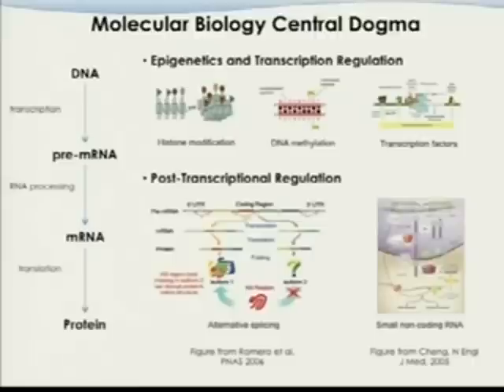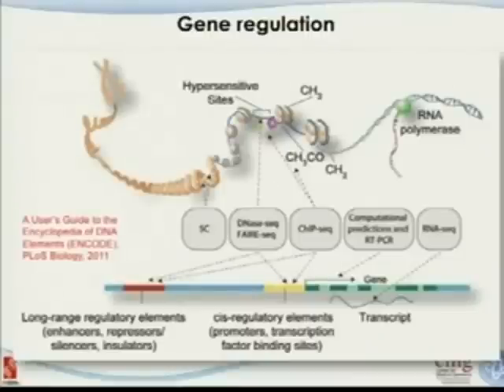If you modify the protocol a little bit, ChIP-seq or some other immunoprecipitation-based sequencing assay can also be used to study alternative splicing and microRNA, which I'm going to give you a little example of today. But overall, what we traditionally refer to as ChIP-seq is to study this level, the histone markers and the transcription factor binding.